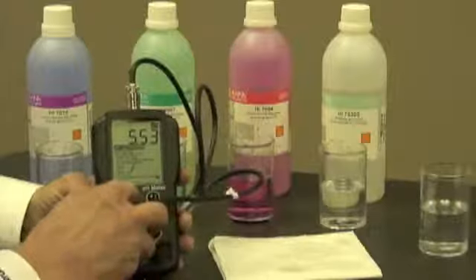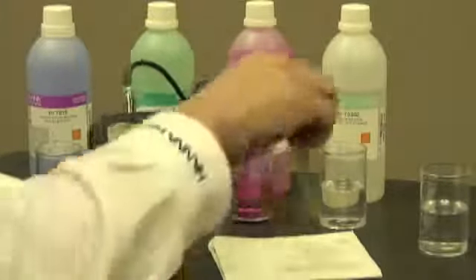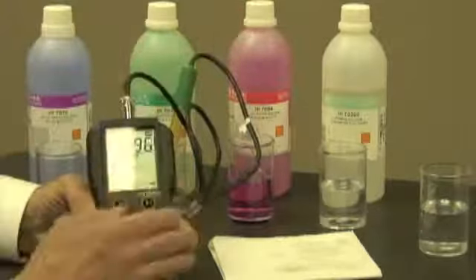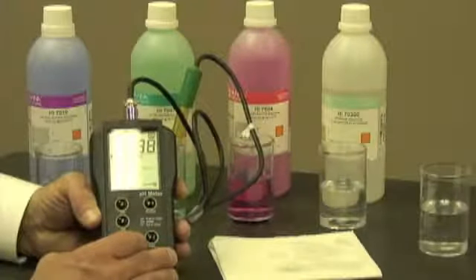Now we can follow the on-screen instructions and do the calibration. It's asking me to put the probe into a pH 7 buffer solution, which is what I've just done. I'm going to let that take a reading.